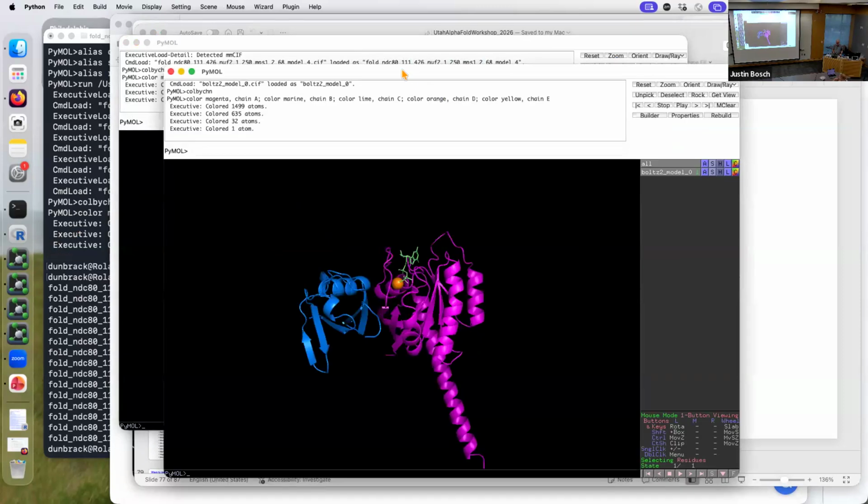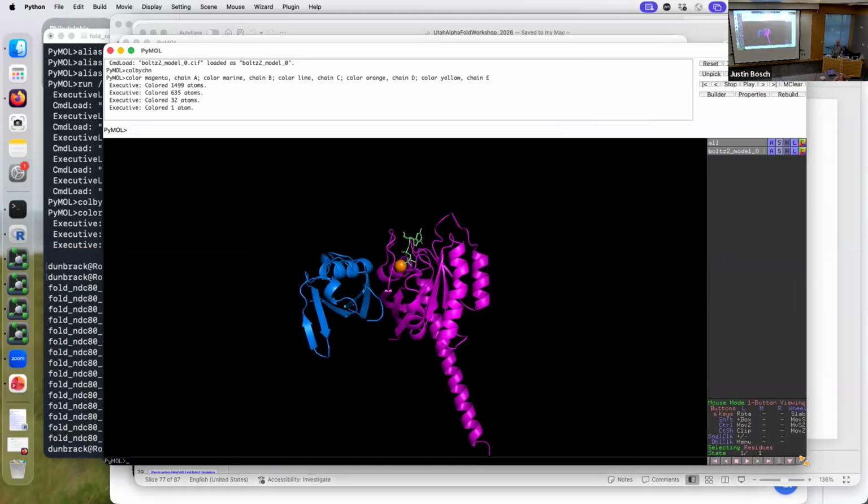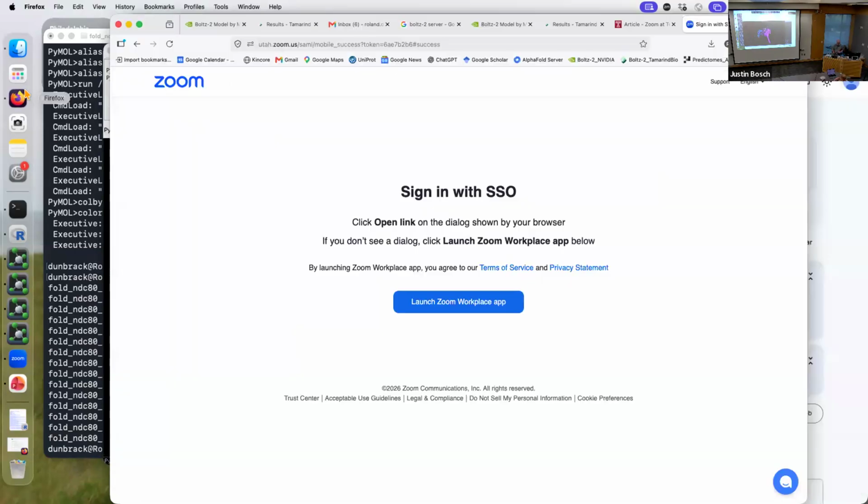Okay, so you can all go to the PDB, Protein Data Bank. The link is in that set of links on that bioinfo page. And you can download the structure of a protein.